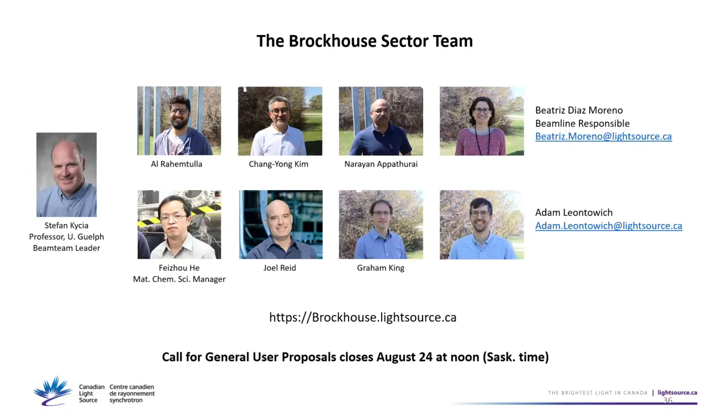You were saying something about form factor and structure factor depending upon the concentration. What if I have a solid sample? It's not a killer. For example, instead of looking at particles in solution, you can look at voids in a solid, and it's kind of the same thing.